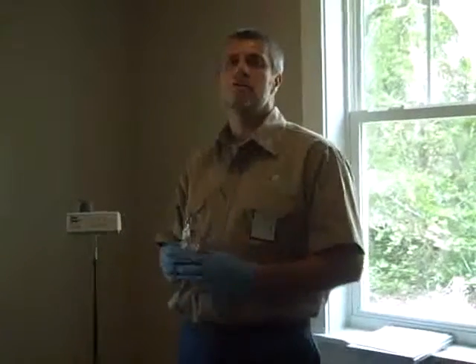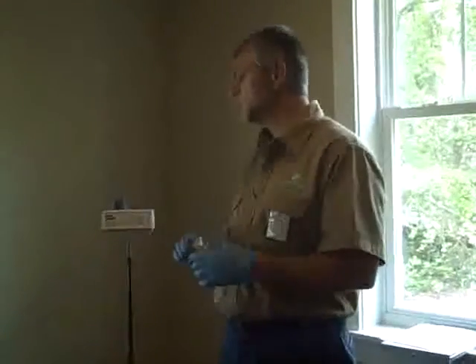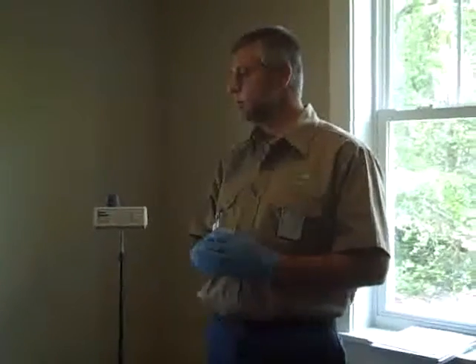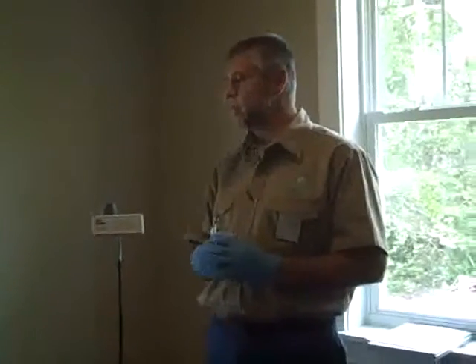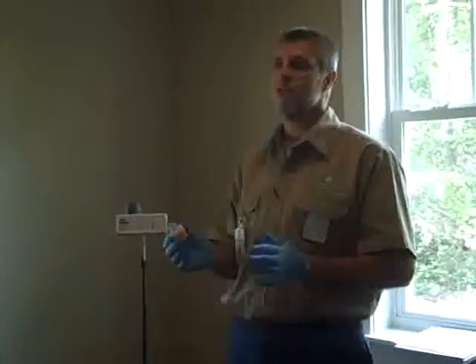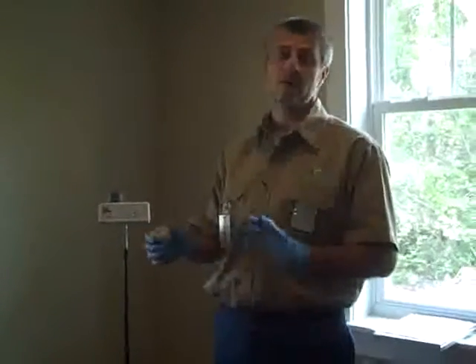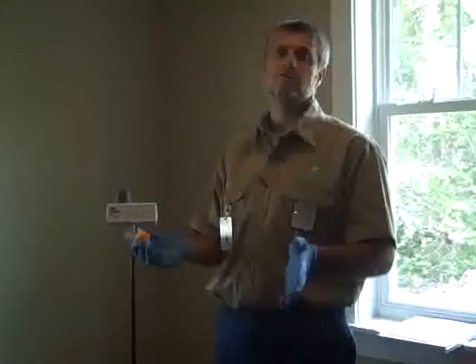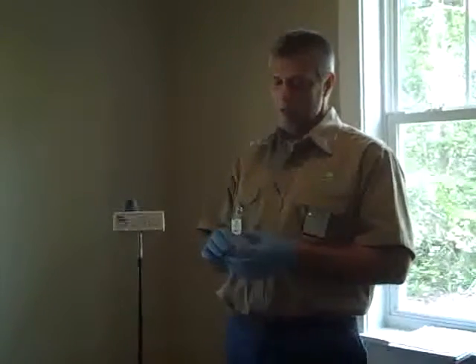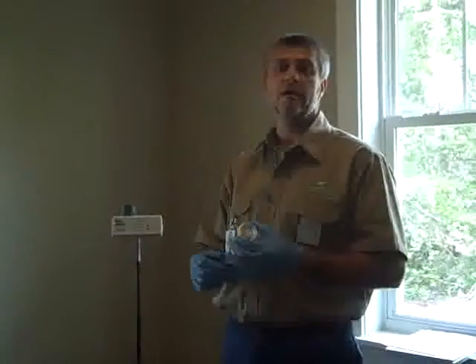Today what I want to show is some sampling methods, and I'm going to go through different parts of how we do our sampling and the different types of sampling that we use. A lot of people talk about sampling, they think about petri dishes that you put out on the table and 3 or 4 days later you come back, see if something's growing. Well, today we're going to show you about real air quality testing.